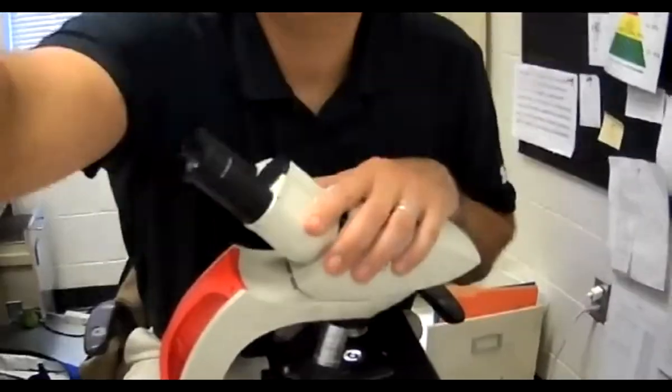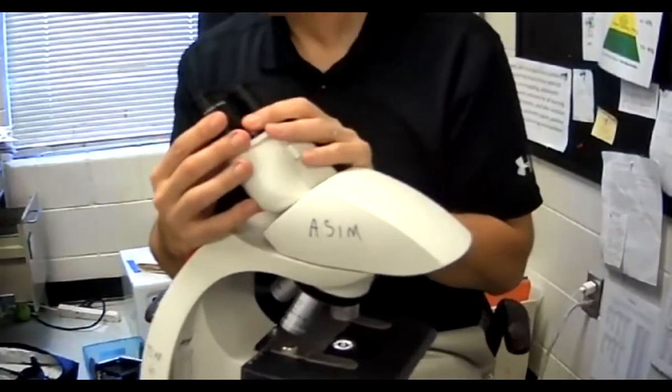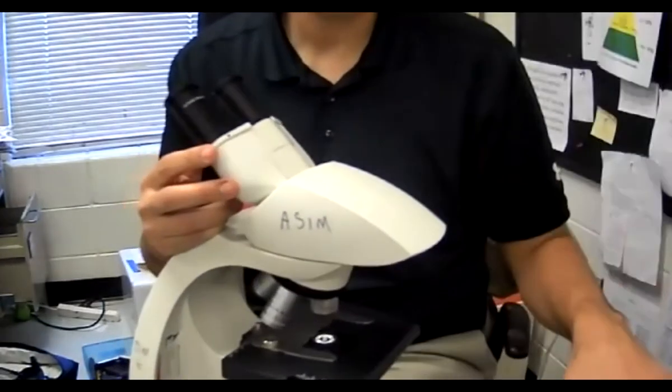We're going to go over the parts of the microscope right here. Starting off, let me point my camera down. I have my eyepieces — these are my eyepieces, also called oculars. You can write that on your paper. These are my eyepieces.